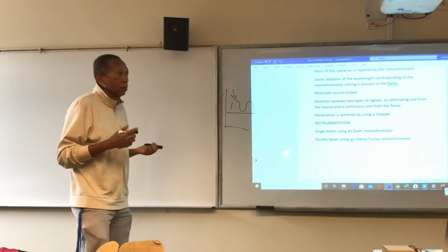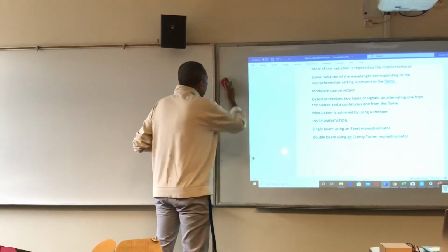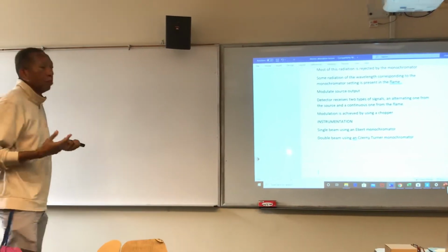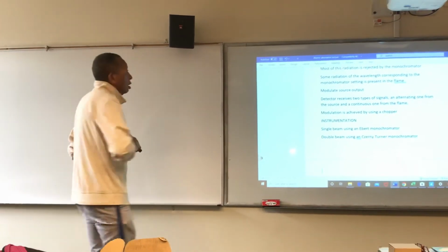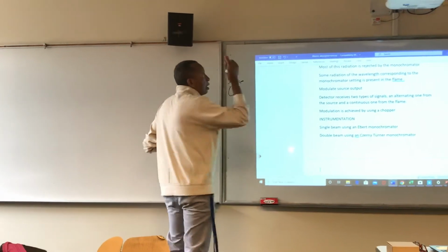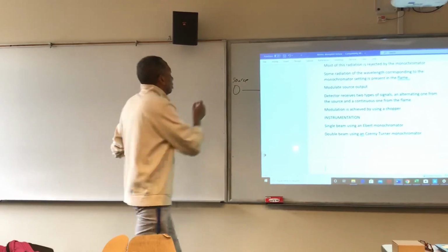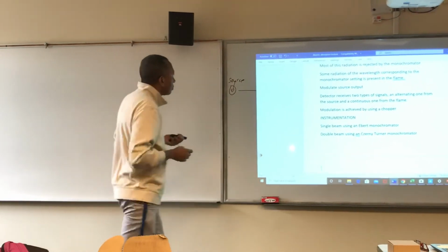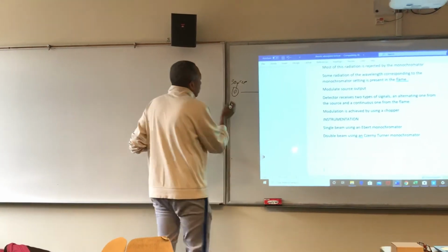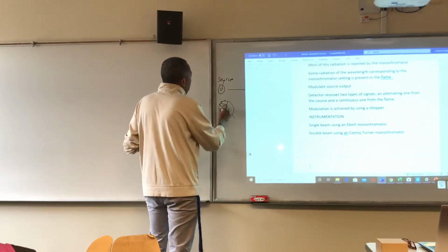We've seen before that if we have a continuous source, the source itself does not have to have a frequency dependence. The output from the source is like the lamp in your house, it's continuous. But we can take that source and, by using a chopper, which alternates like slices of the pizza, modulate it.